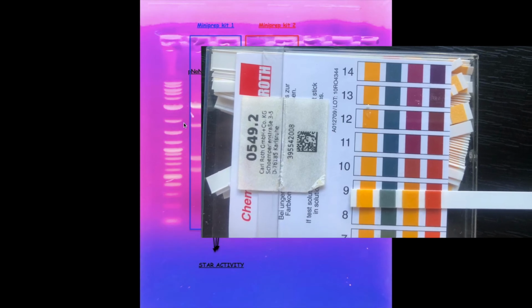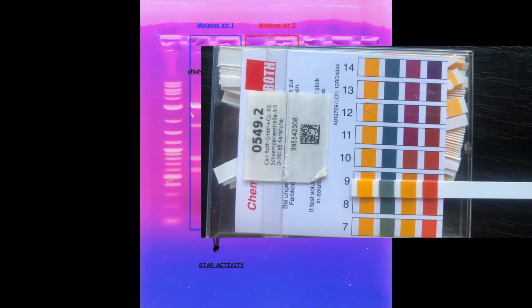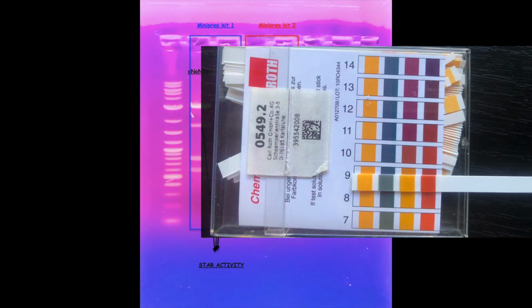After measuring this with a NanoDrop, I found out that my mini prep kit 1 is not as pure as the mini prep I did with kit 2. The preps were not bad per se, but this is the problem I got, and how I solved it. So my plasmids got assembled perfectly.